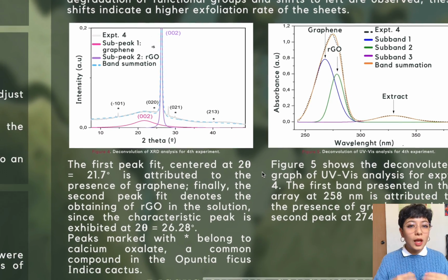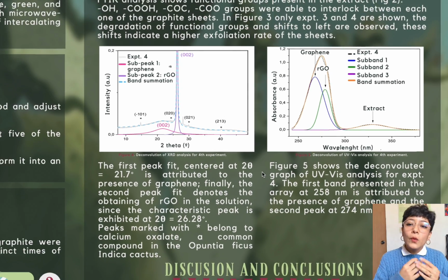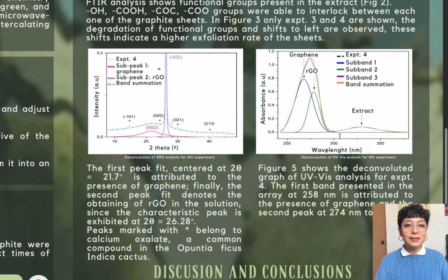Figure 4 shows the spectra of XRD analysis, which had to be treated with a deconvolution process to be able to observe all the component bands of the original spectra. The first peak fit, centered at 21.7 degrees, is attributed to the graphene. The second peak fit denotes the obtaining of reduced graphene oxide in the solutions, since the characteristic peak is exhibited at 26.28 degrees. As we can see, there are peaks marked with an asterisk belonging to calcium oxalate, a common compound in the prickly pear cactus.